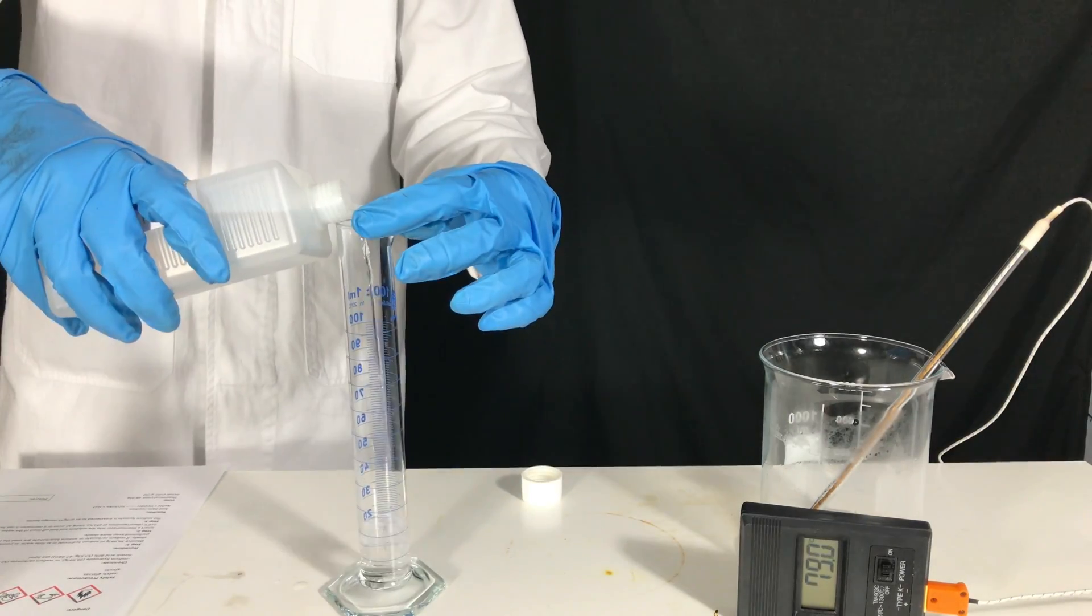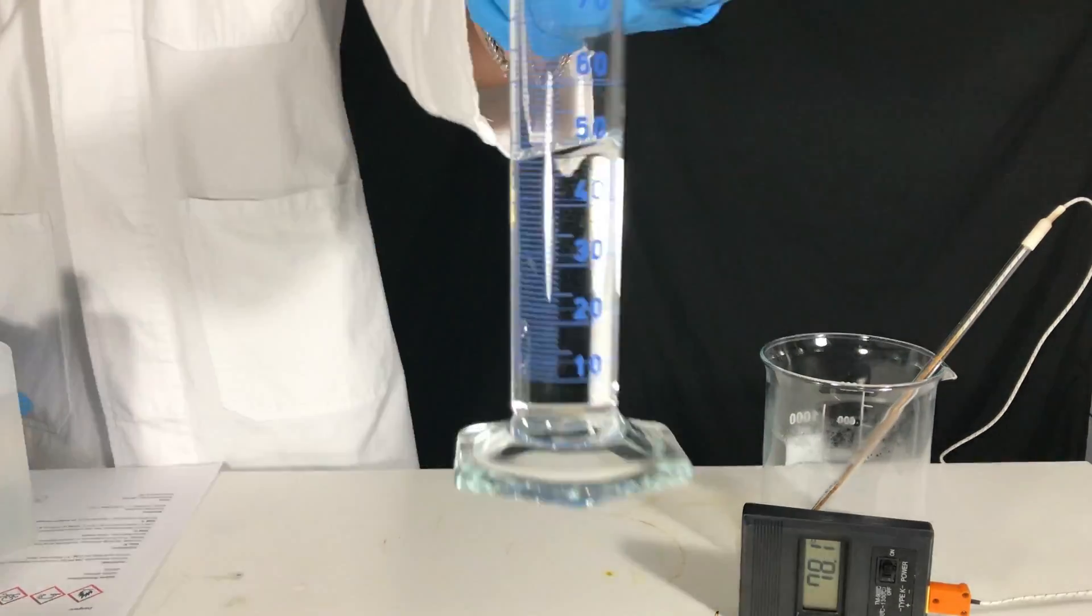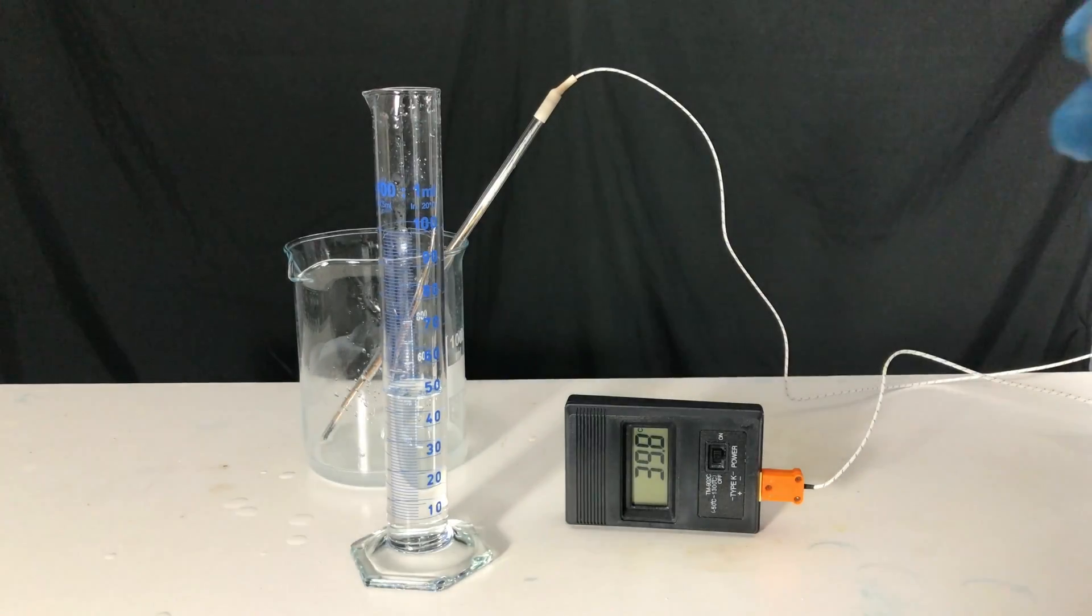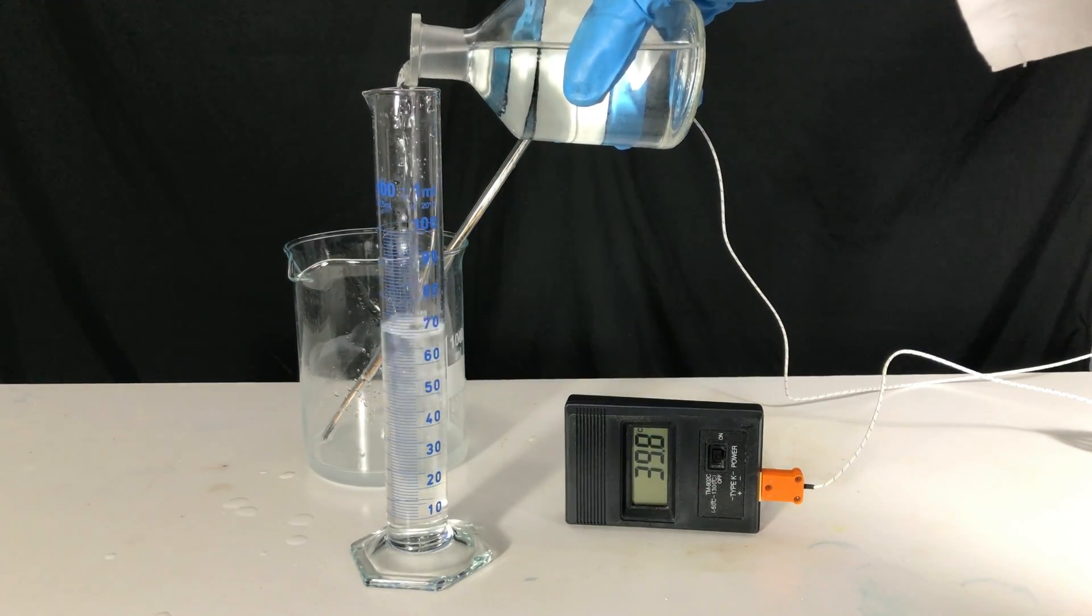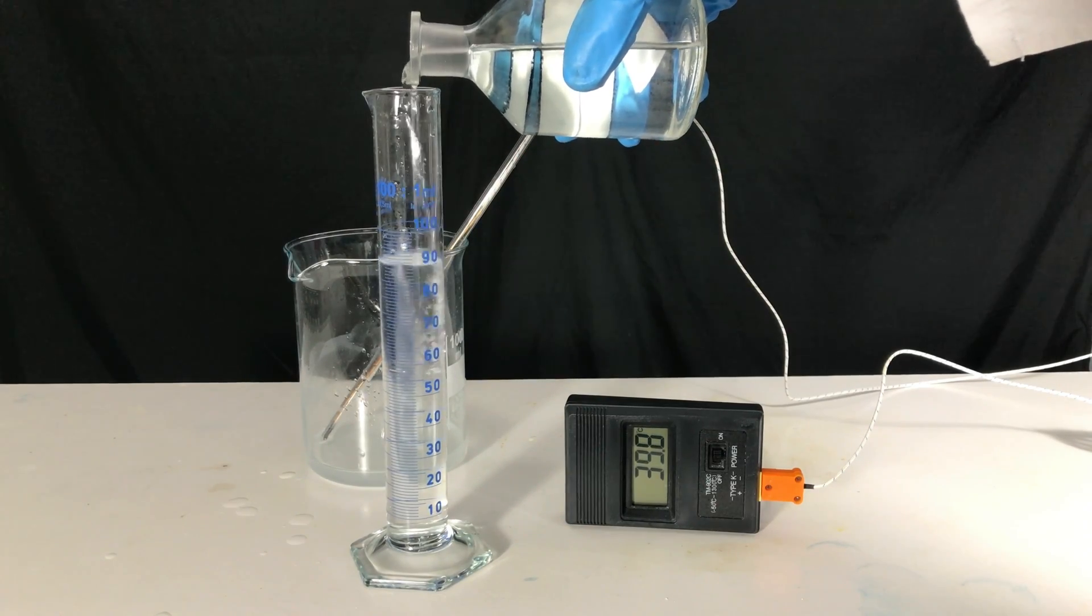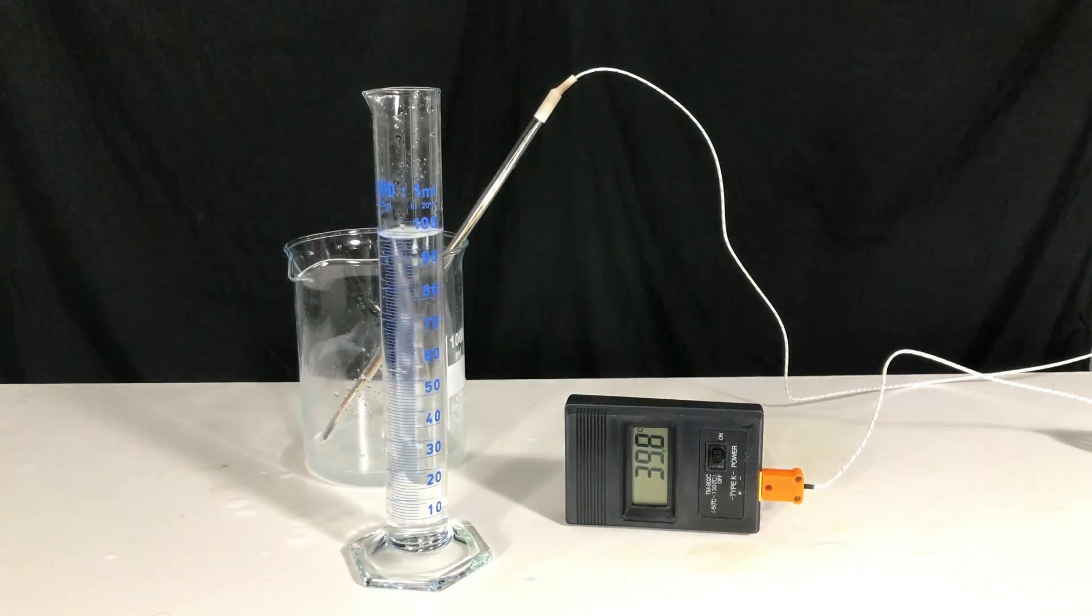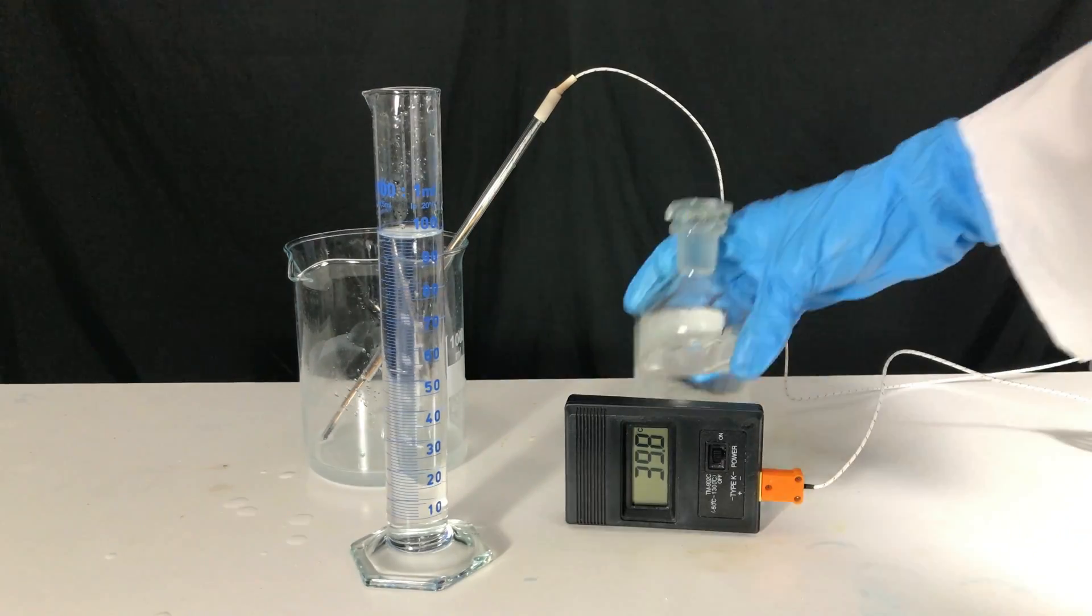50 ml of 80% formic acid were measured out. A small excess of formic acid is needed. Using distilled water it was diluted until it had a concentration of 40%. 50 ml of distilled water were added in total.